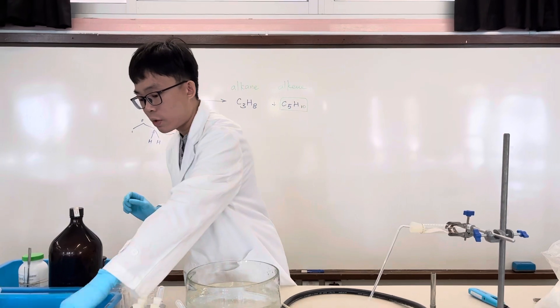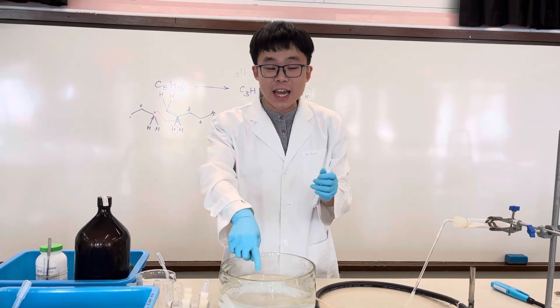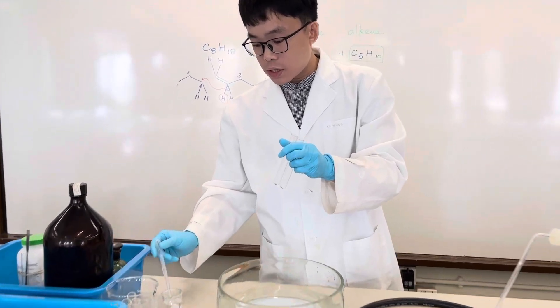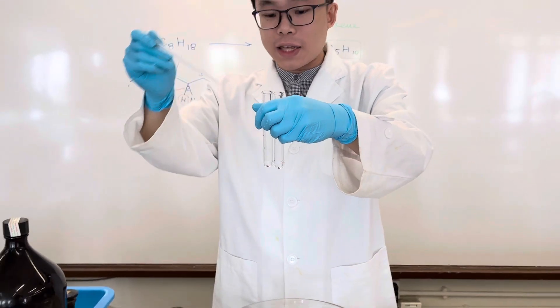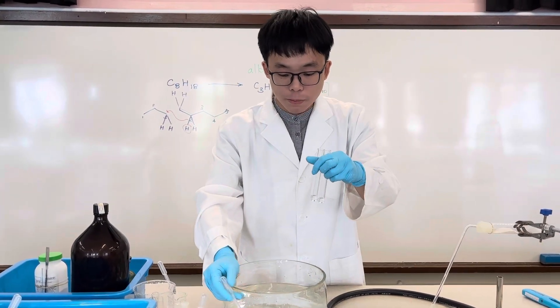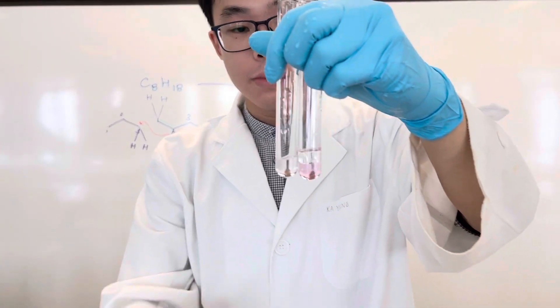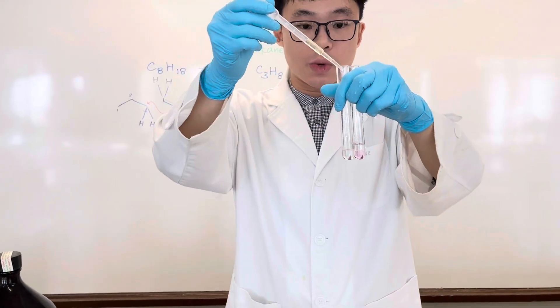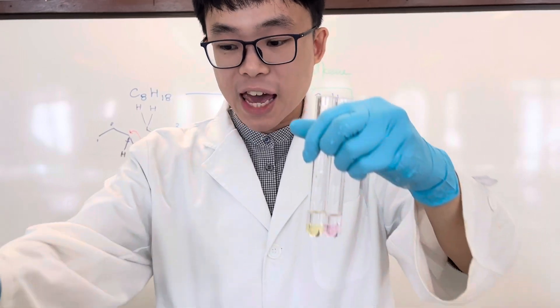One more thing I would like to check: let's test the medicinal paraffin itself to see whether it reacts with potassium permanganate and bromine solution as well. Here is the beaker with medicinal paraffin — it is oily in nature because it is organic. Adding the purple potassium permanganate, of course it separates into two layers because the potassium permanganate is in an aqueous layer. And the bromine solution as well. Did the colour change compared to what we observed with the cracked product?